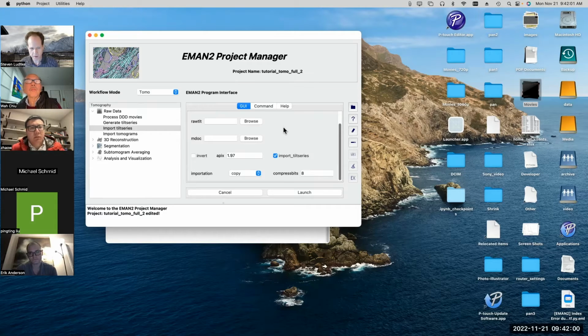In the tomography pipeline, it's conventional to use negative density for whole raw tomograms. So we adopted that convention since otherwise people in the tomography community just didn't like it. They said, oh, wow, what's this? The particles have the wrong contrast. So for the whole tomograms, particles have negative contrast.